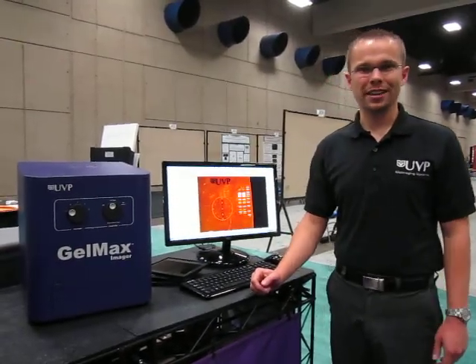So for your precast gel or mini gel imaging application needs, feel free to contact UVP and take a look at our brand new GelMax Imager. Thank you.